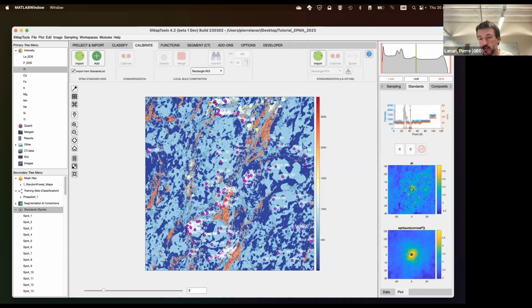So in the center position, the value of the pixel here in the center, the correlation, and you see it's the maximum value here, it's around 0.9. So it's a very good correlation. And this is the correlation between the two curves on this figure. So what this figure is showing you is what would happen if you would move now the spots.